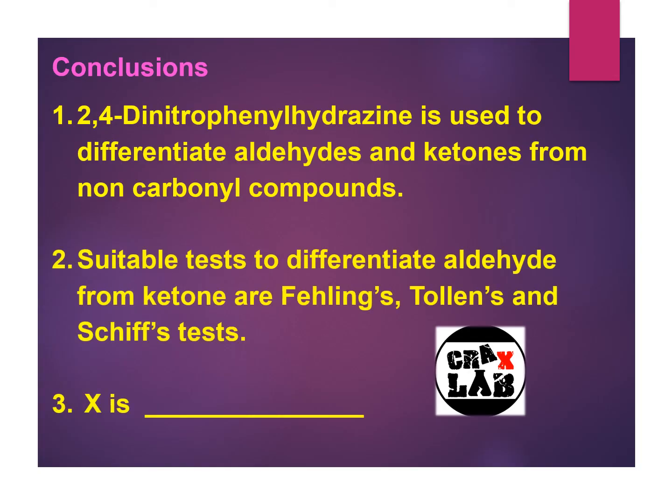Number 2, suitable tests to differentiate aldehyde from ketone are Fehling's, Tollens', and Schiff's tests. And for number 3, the compound X, please state based on your observation.